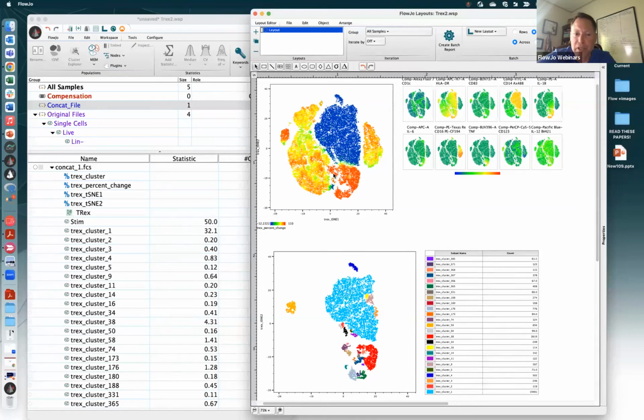And then the population down here and over here that really did show a big difference are, let's see, things that are perhaps a little TNF positive, IL-6 perhaps. They also have some HLA-DR, some IL-1B. The little population there stood out as CD123 and HLA-DR, again, different.